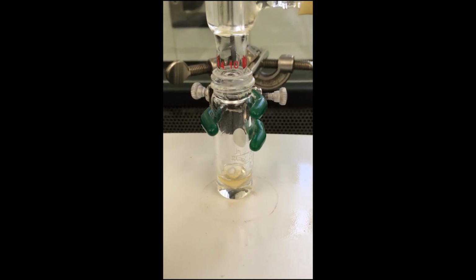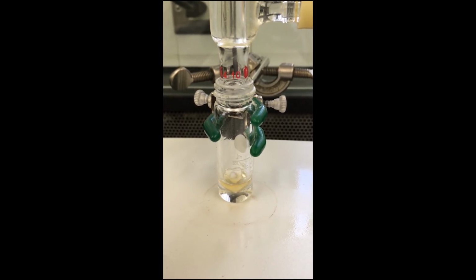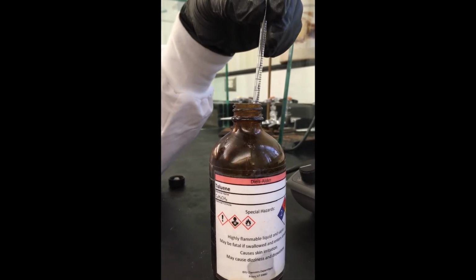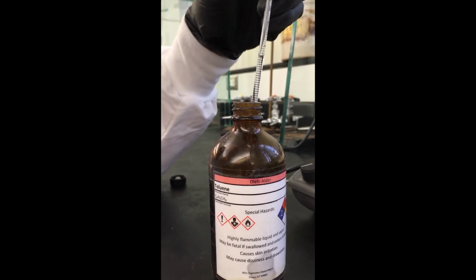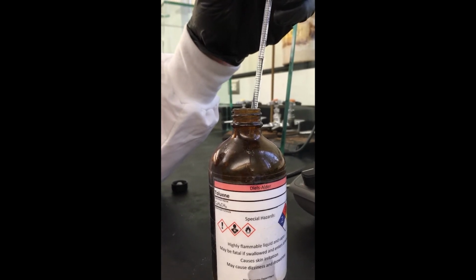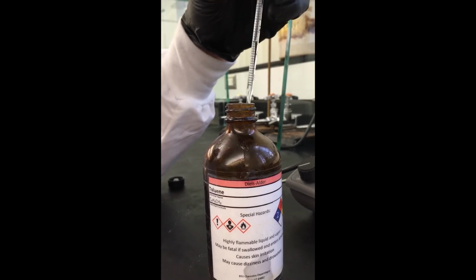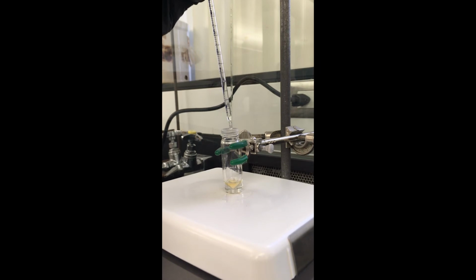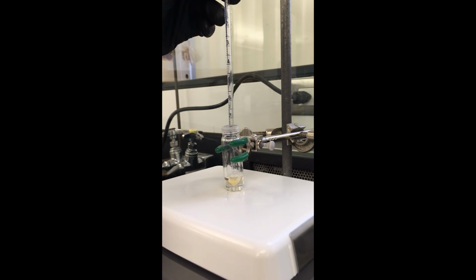I'm going to let this vial cool off to room temperature, and then I'm going to add some toluene to encourage crystallization. Okay, so I'm going to measure out 250 microliters of toluene. So you can see there we're at about 0.25. And now that our reaction is cooled down to room temperature, I'll add that toluene to the reaction vessel.